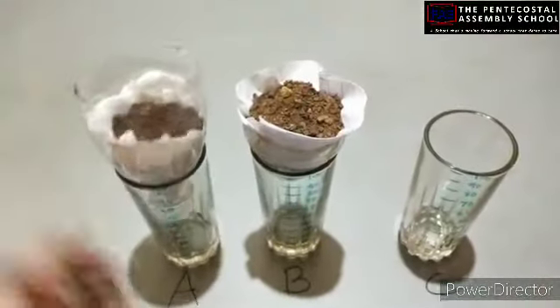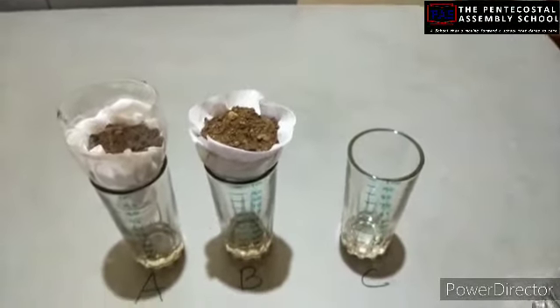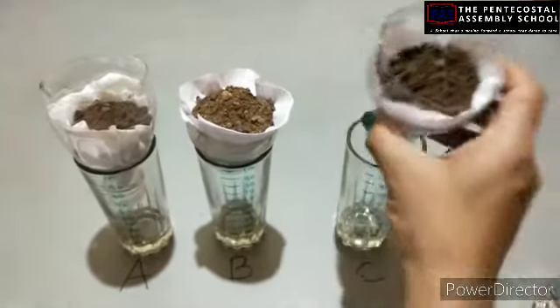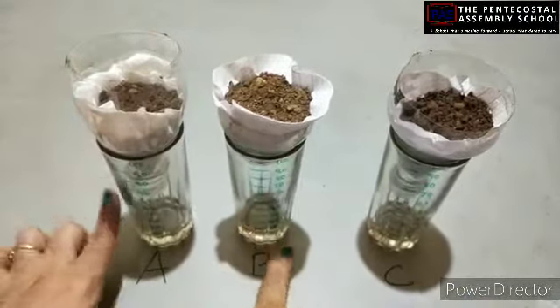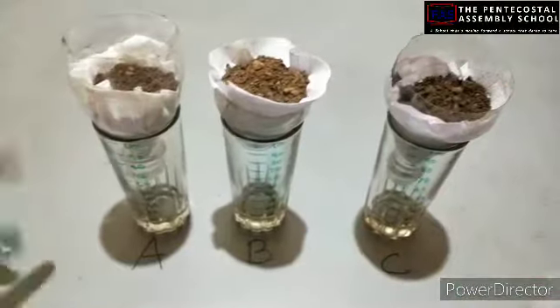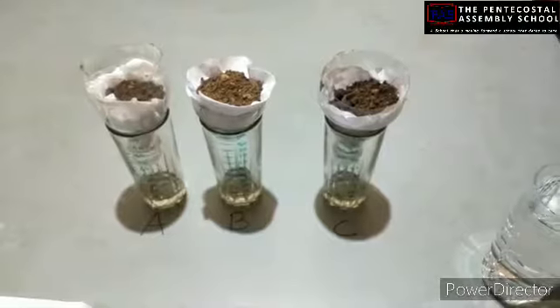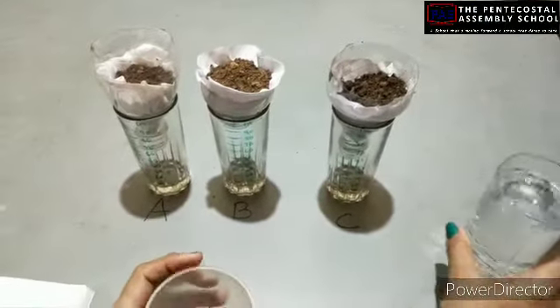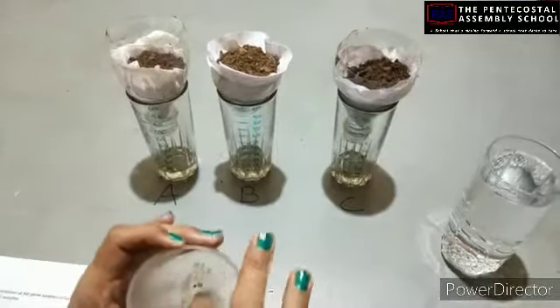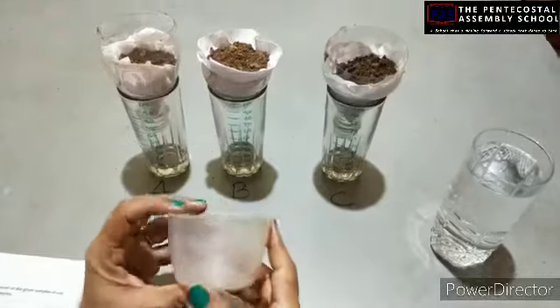And now we have to keep this in the 3 measuring cylinders. So now we have the 3 measuring cylinders with 3 funnels with 3 soil samples. Now we are going to read the percolation property, how much water it can hold and how much water can percolate through it. That comparative study we have to do.